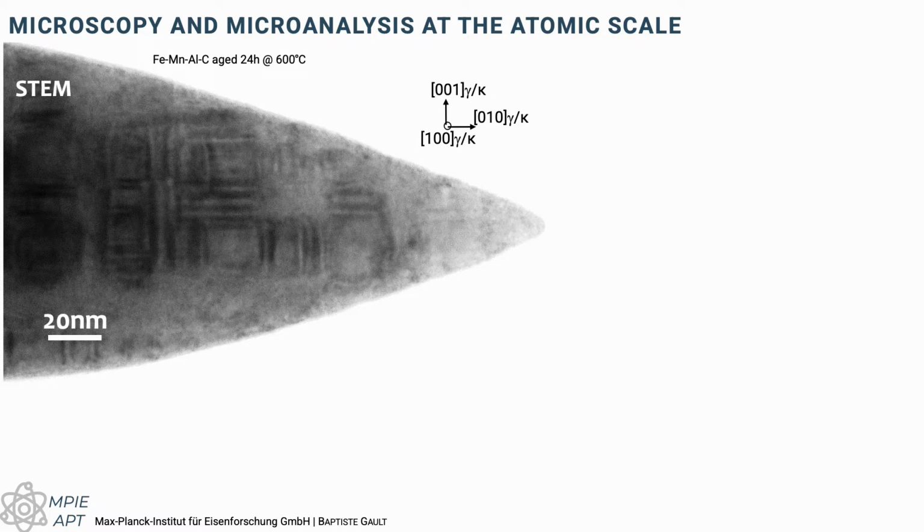So in comparison to transmission electron microscopy, typically our specimens are thin, so we can use those in a TEM, inside of the TEM to provide some imaging. Here you have the electrons going straight through the specimen. We can see some contrast pertaining to precipitates in this precipitation hardened stainless steel, austenitic steel, sorry.